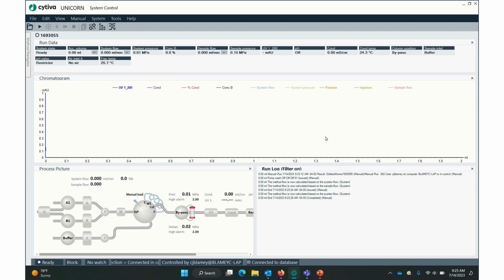So today we're going to try to test our method that we just wrote in the previous video I recorded. This won't take long. You can use this technique to test any method that you've just written, more or less. There are some things you can't do with it.